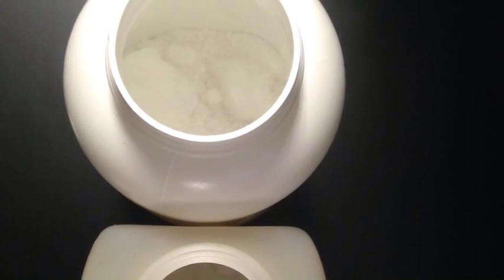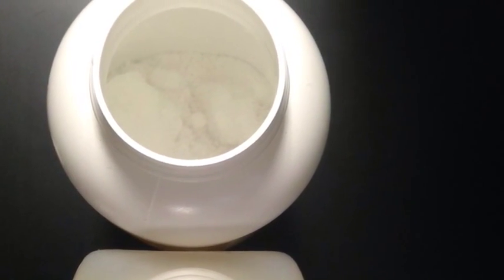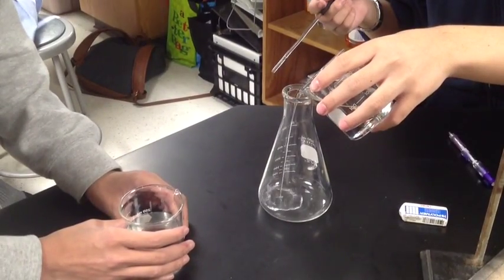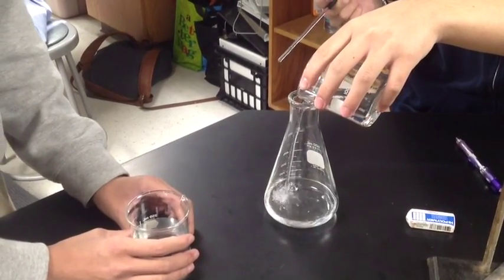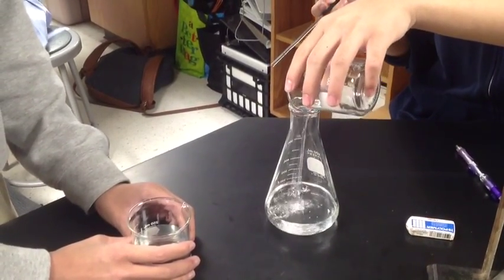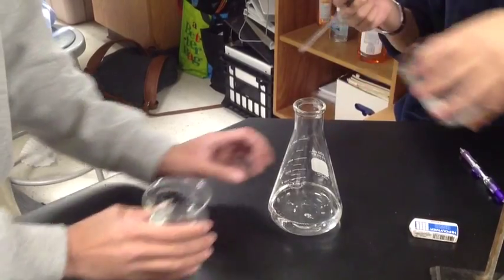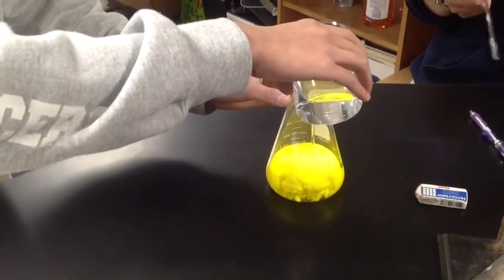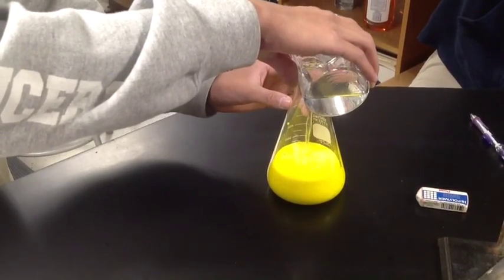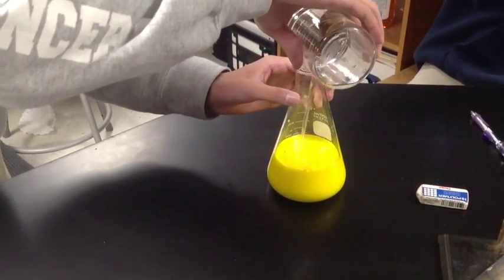Both lead nitrate and potassium iodide are white crystals, but when we create solutions they are transparent. Here we are pouring in potassium iodide, and as you see it is clear, but when we add the lead nitrate we get a very bright yellow precipitate forming.